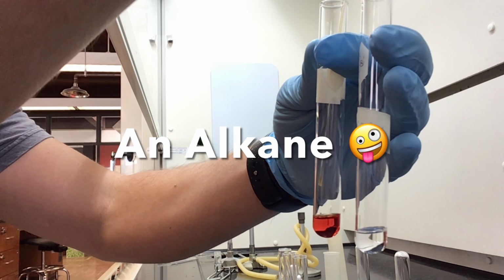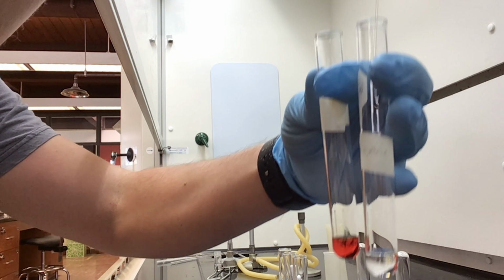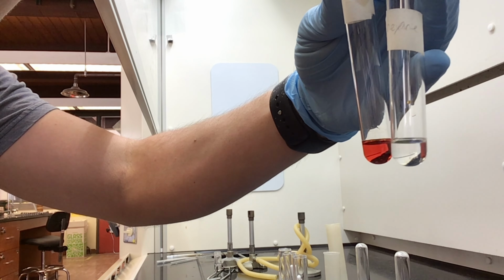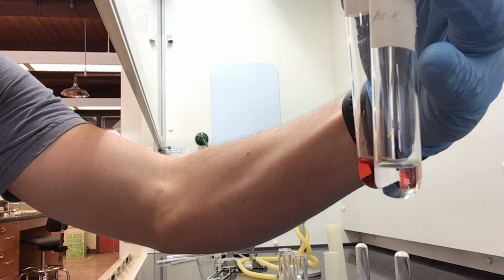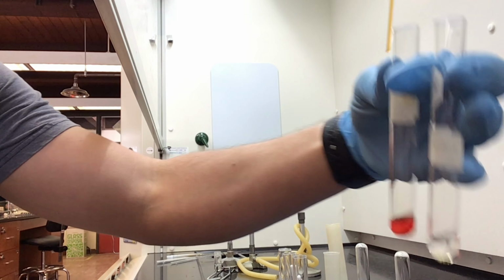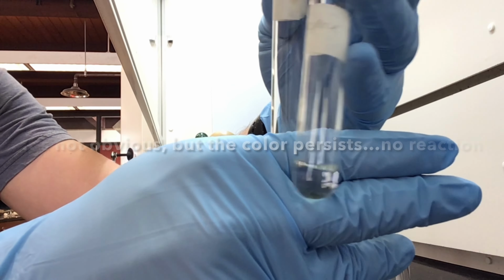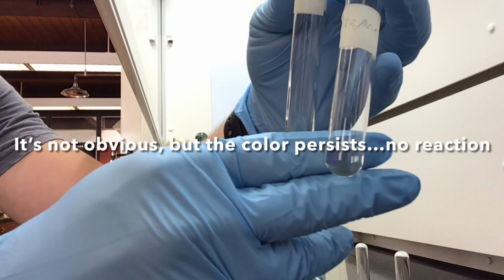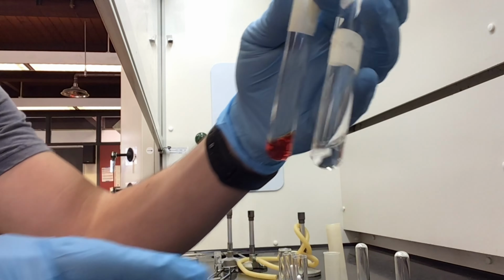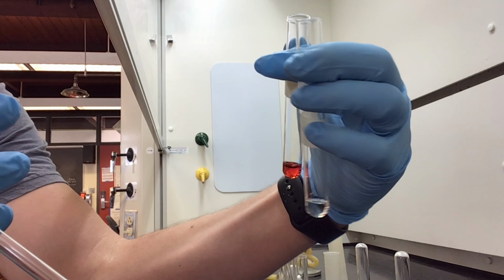So what else can I do? Bring it in. We're doing an alkane. All right, see what happens. Look at that. Boom. Oh, can you see the color? Drop it in, and pay close attention. You can see it kind of settling at the bottom. Let me see if I can show you a better look. It's tough to see, but it's obviously much easier in person, though that 2 drops is still present at the bottom. It looks kind of like a yellow, maybe orange color.